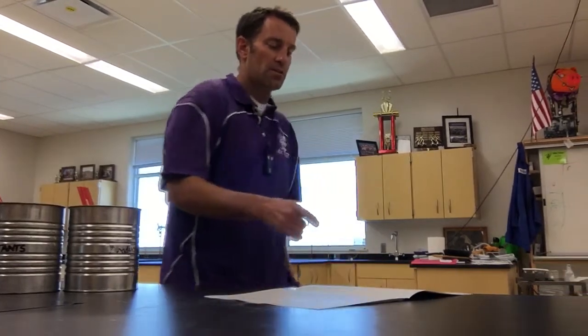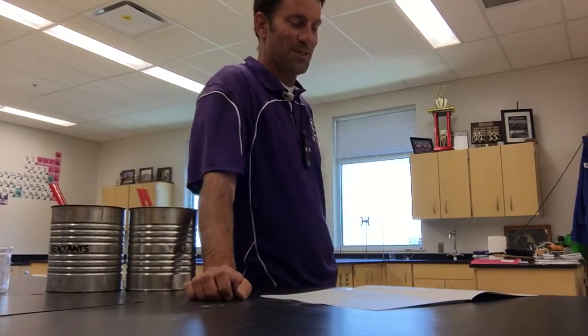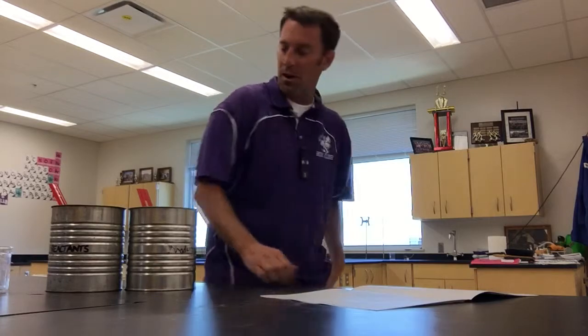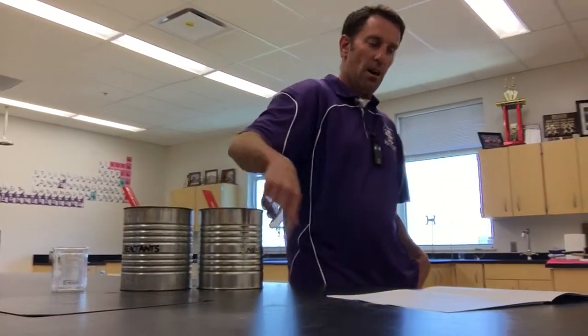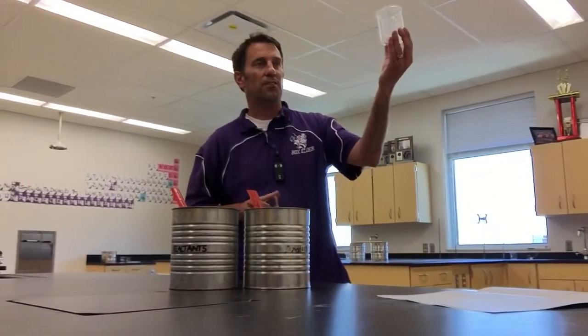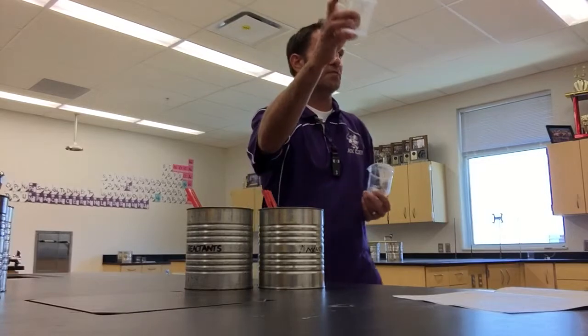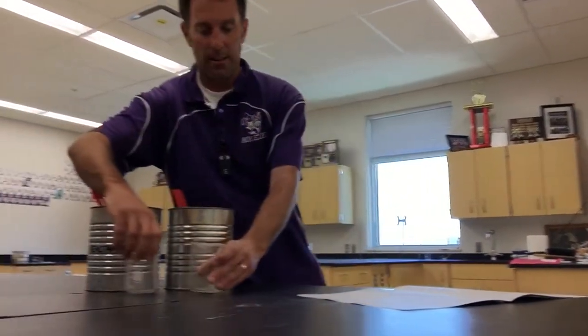All right, I know I did this for you guys yesterday, but this is for fifth hour since you never see me. We're going to put water in cans, label products and reactants. You will use the appropriate size beakers. In this lab we have a 250, the big beaker, and the 150, that's the small. Small goes into the, yeah, it's not that hard to figure out.